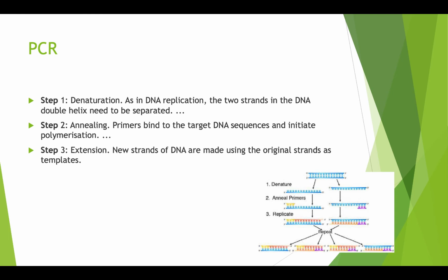You are trying to do a polymerase chain reaction. You're doing a chain reaction, so you are doing the same reaction over and over and over. Each time, like a chain in a chain, you are doubling the amount of DNA that you have.